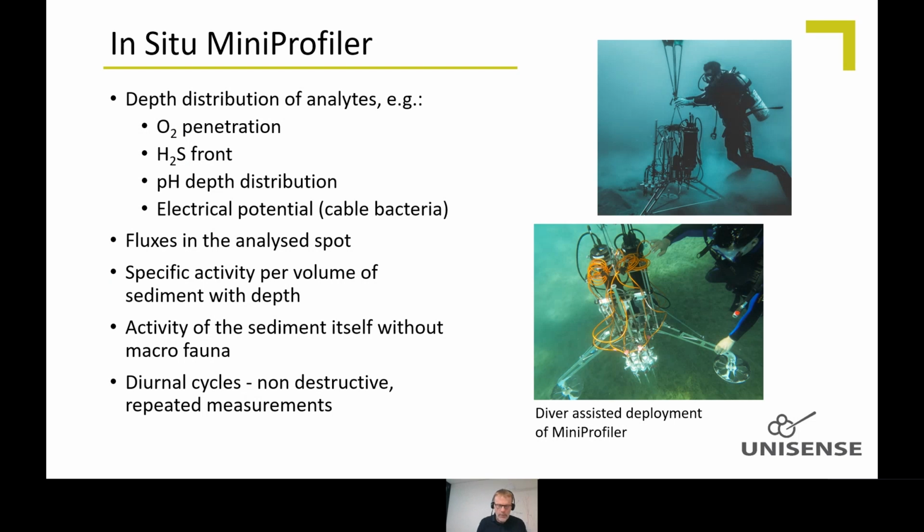So just as when you measure microprofiles in the lab, you are interested in probably knowing oxygen penetration into the sediment. Where is the sulfide front? What is the pH in the sediment? And is there an electric potential, an indicator of cable bacteria, and so on? So all our sensors can be used on the mini profiler.